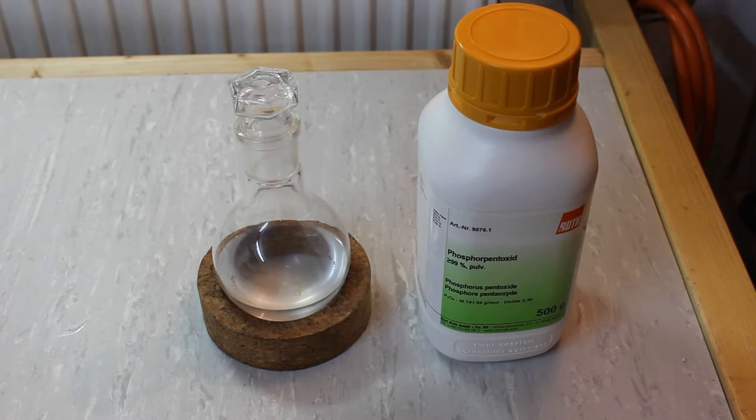To further dry the Bromoethane to completion, I'm using Phosphorus Pentoxide. This will remove any remaining traces of water and achieve the dryness I will need for my upcoming Grignard reaction.